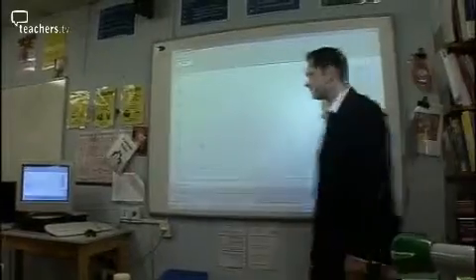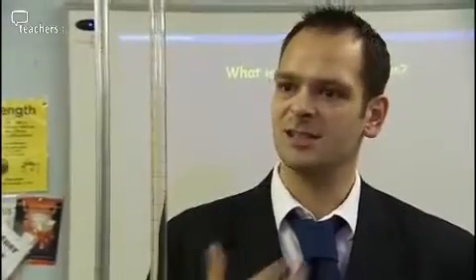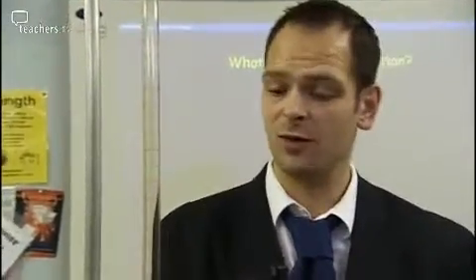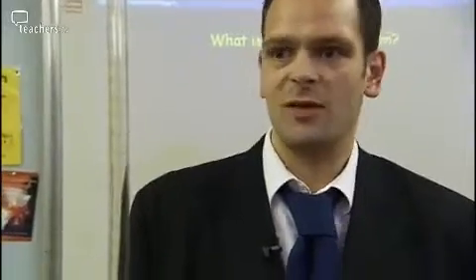Fantastic. Great. When they actually see the curve changing, it's almost within a few seconds they understood what was going on, and they could see how things were developing because we discussed it beforehand. Now, if you were to do this without any kind of ICT, you'd be trying to convince them that that's the case, and it would be very difficult to do so.